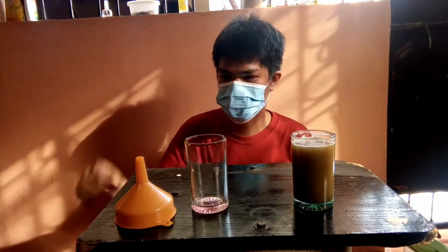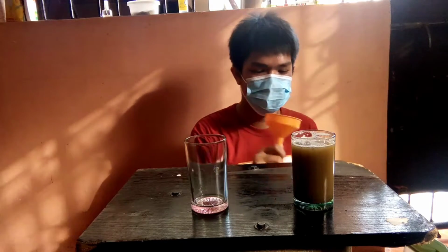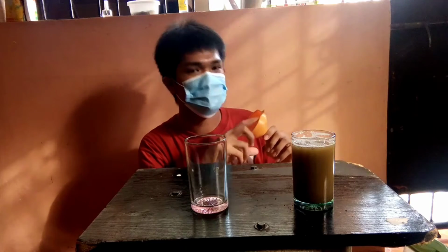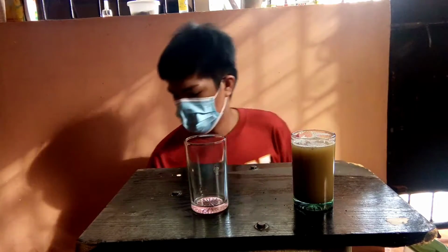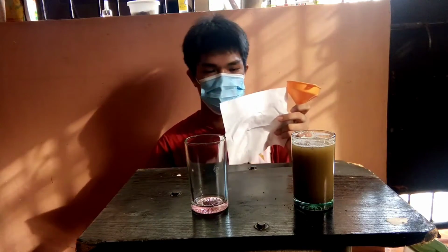So now we're moving on to the second procedure, which is using this funnel. We're going to cover the inside of it with filter paper. But since I don't have filter paper, we're going to use an alternative for filter paper, paper napkin or paper towel. So we're going to use two paper towels.